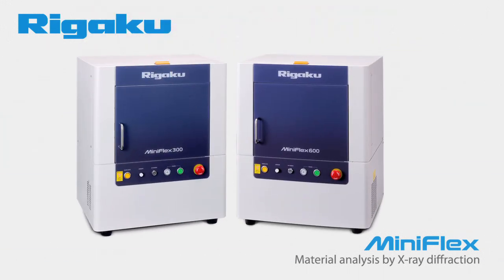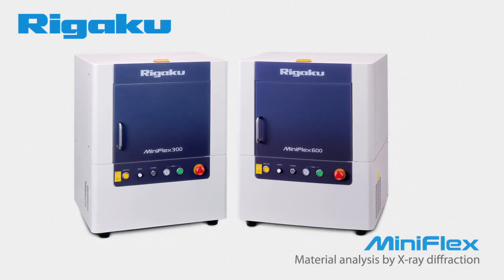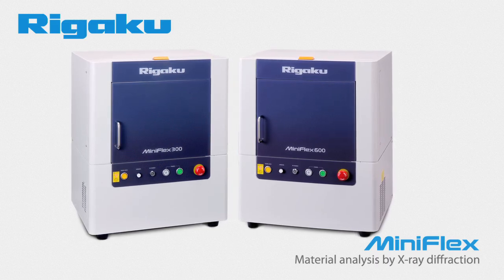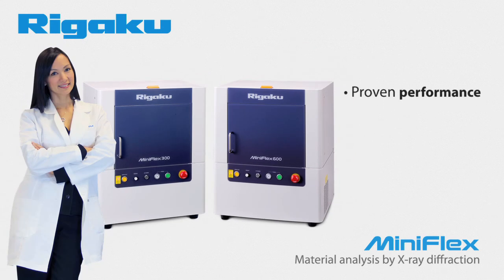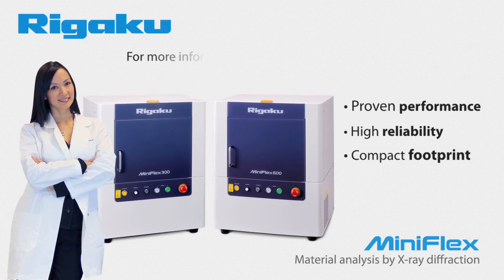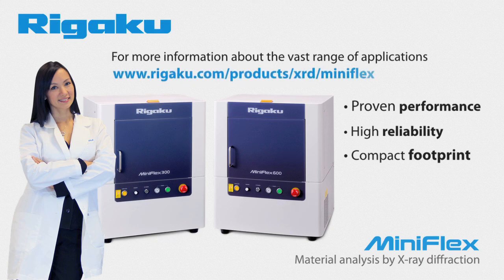After almost 40 years, Rigaku has fine-tuned and enhanced the benchtop diffractometer concept to a point where the MiniFlex is well respected as a research, QC, and teaching tool throughout the world. With proven performance, high reliability, and a compact footprint, the MiniFlex has redefined the concept of X-ray diffraction and created a large global community of satisfied users. For more information about the vast range of applications addressed by the MiniFlex, please visit rigaku.com/products/XRD/MiniFlex.